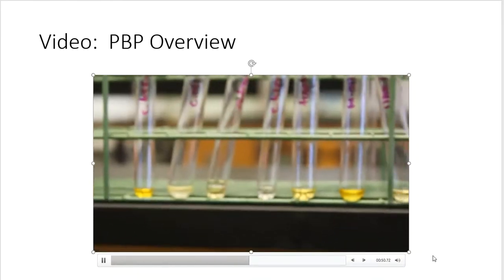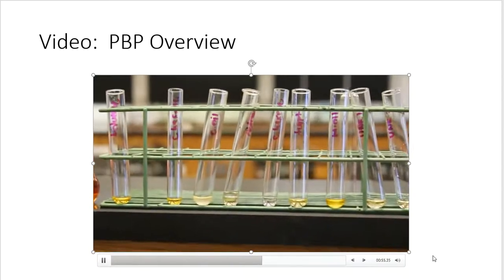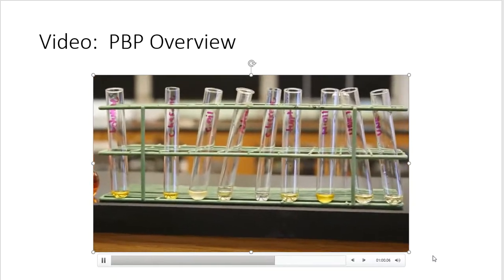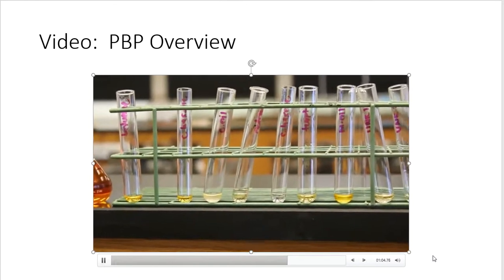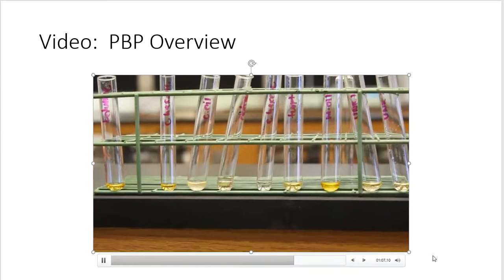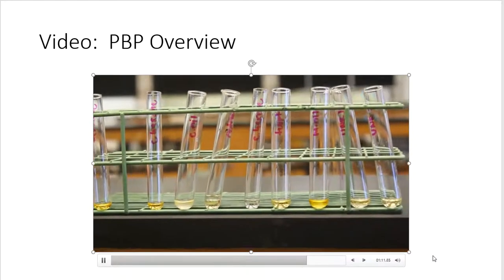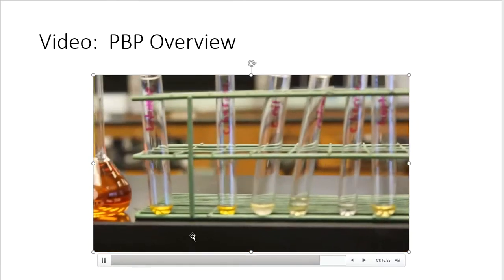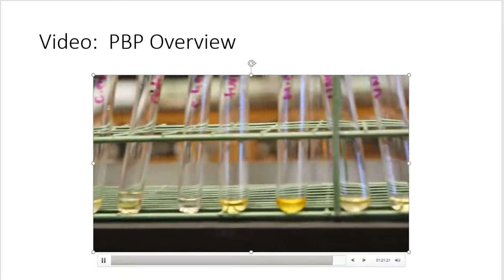Folks, there is the result of the qualitative test for alkenes. All right, so once again, we are looking for a distinction of yellow color that's left behind, because that means it's not reacting with our bromine. So if we see the yellow color, that probably means we don't have an alkene on our hand. So you use your judgment, write down your observations, and fill out that data table sheet.